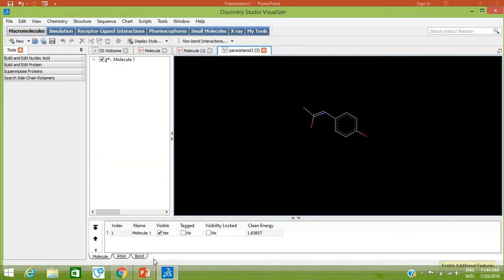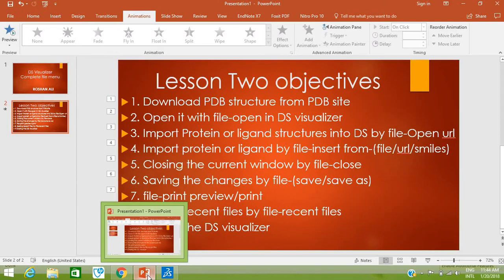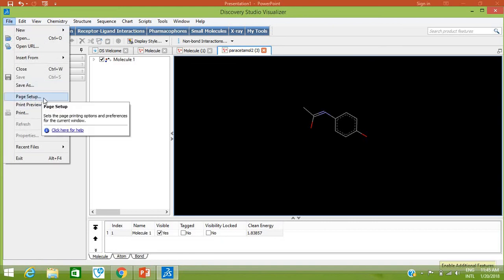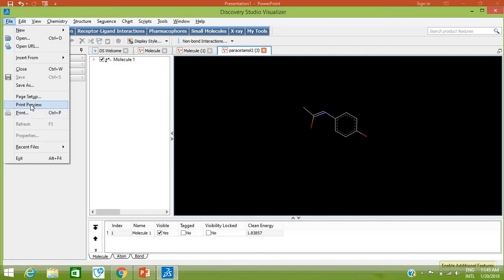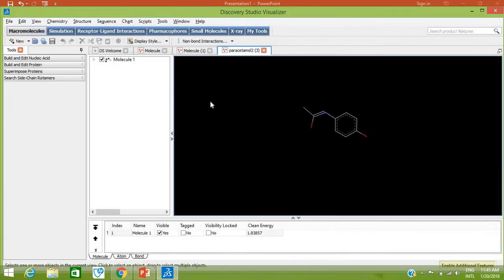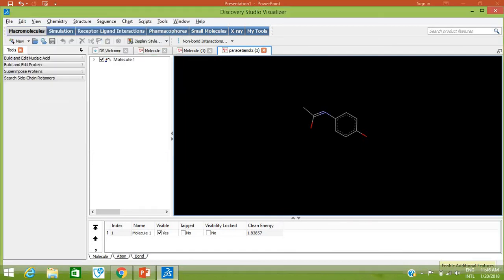Our next objective is to see the print preview and how to print the current window image on paper. For example, if you want to print this structure, go to Page Setup to set headers, footers, and page orientation — landscape or portrait. Then go to Print Preview to see how it will be printed: black background with the structure. To print, go to File > Print, select the printer name. My computer is not connected to a printer right now, but if you are connected it will print on paper. Cancel it.